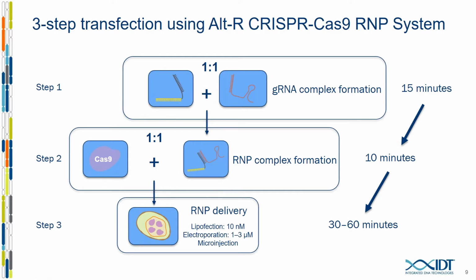And we have protocols online for lipofection-based delivery. We have protocols for electroporation with either the Amaxa Nucleofector or the Neon system. There are also some user protocols for microinjection and other more niche systems. Again, all of these can be accessed from the IDT website.